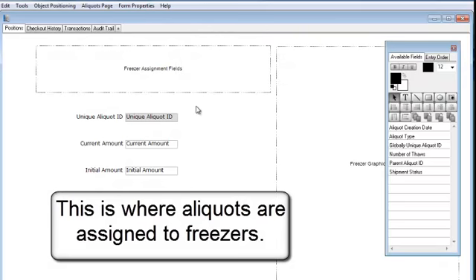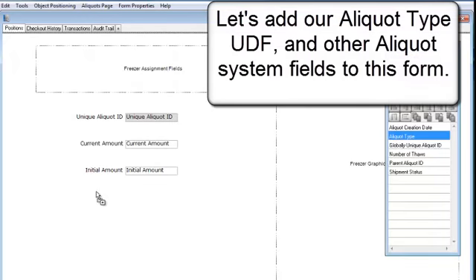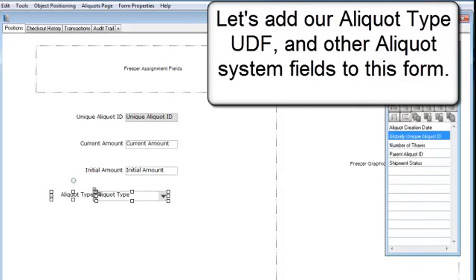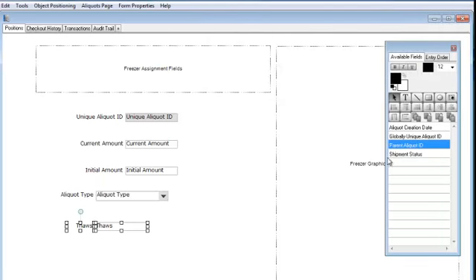This is where aliquots are assigned to freezers. Let's add our aliquot type UDF and other aliquot system fields to this form.